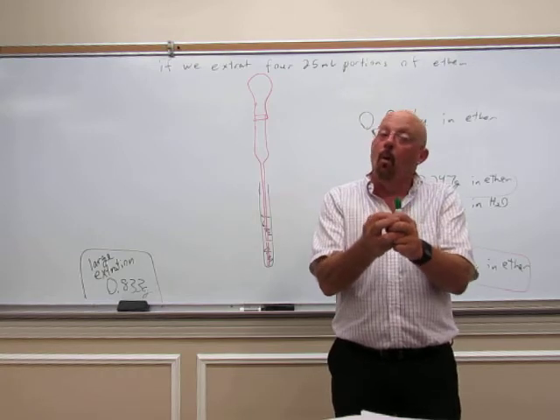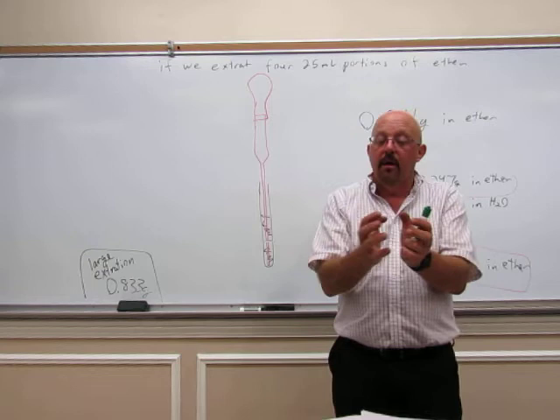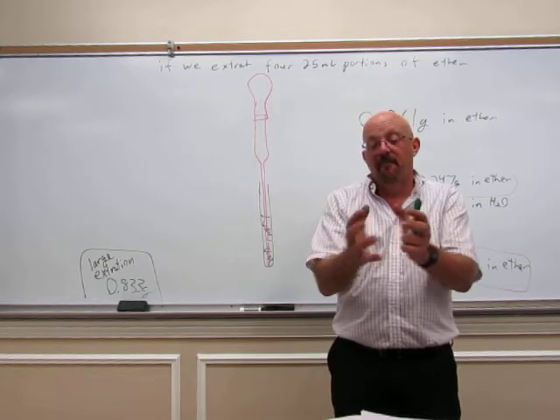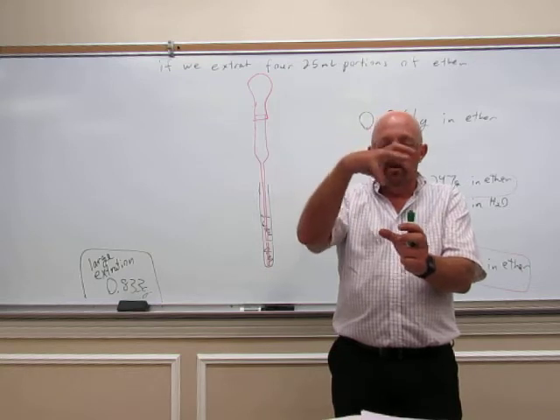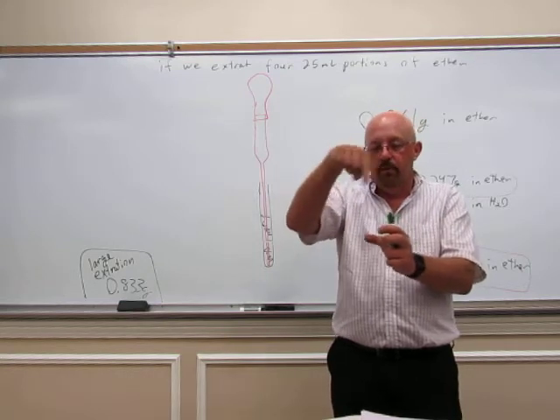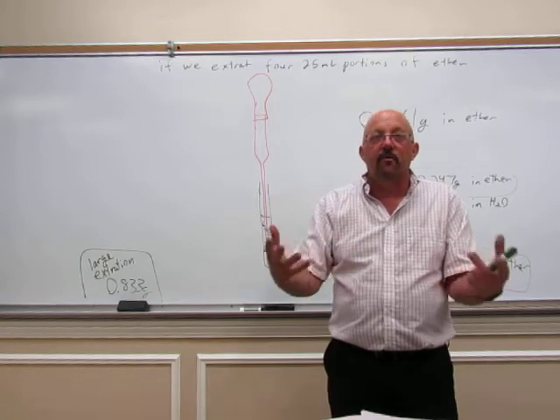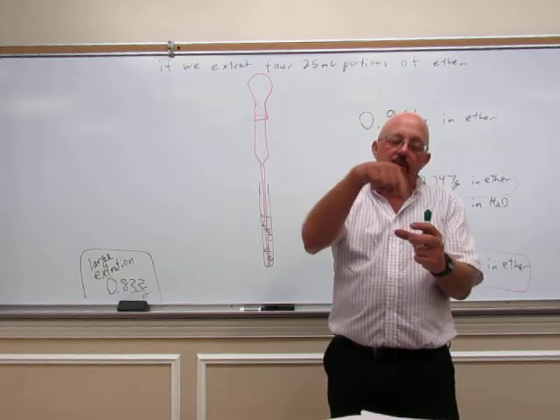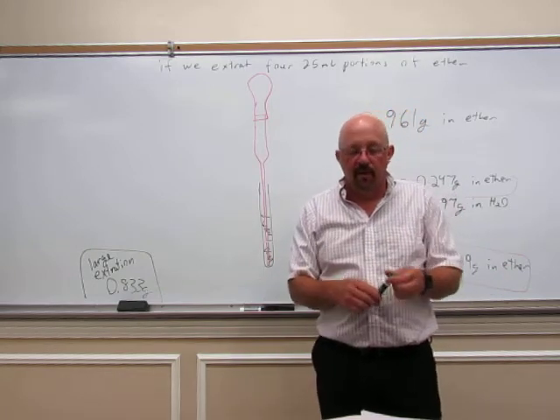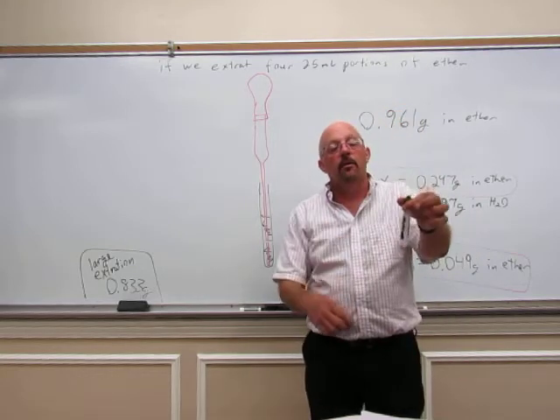Now, if there's no more water in there, then so maybe 4 or 5 pellets clumped together. If there's no more water in there, then there's nothing for it to stick to. Then there should be 1 or 2 pellets that can move around. So if you had, say, 7 pellets in there and 5 of them clumped, then the other 2 should be able to move when you flick the tube. Now when you flick a tube, I'm going to use the marker here as my tube.